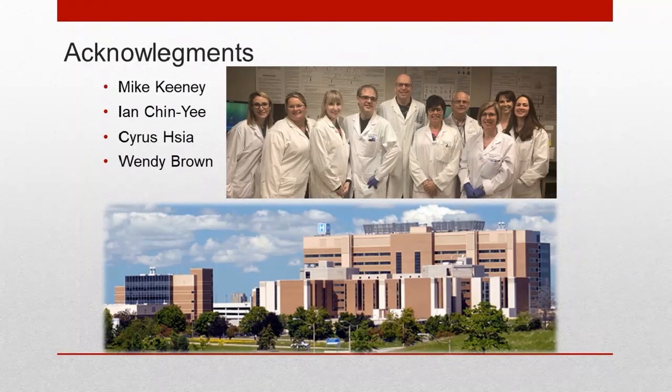You do have to be a little careful with very bright antigens in any panel. I don't have the PowerPoint up here, but I will answer that question offline. It is something you do need to be aware of when you have extremely bright fluorochromes and whether they are spilling over into the next channel. You have to be very aware of that if you have immunoglobulins after something that could be extremely bright. Sorry, I don't have the presentation up right in front of me right now.